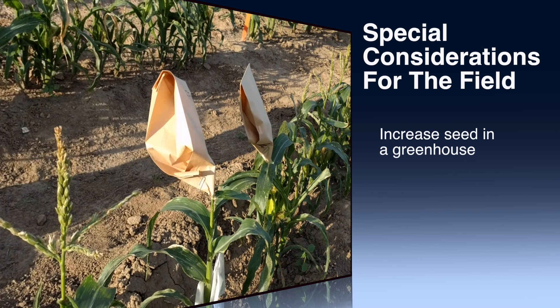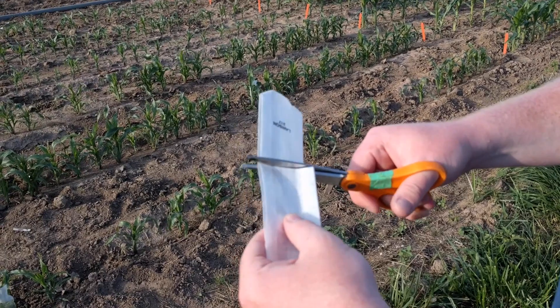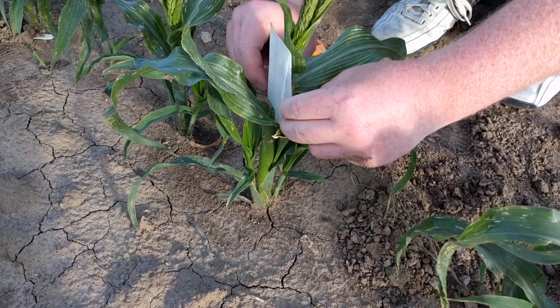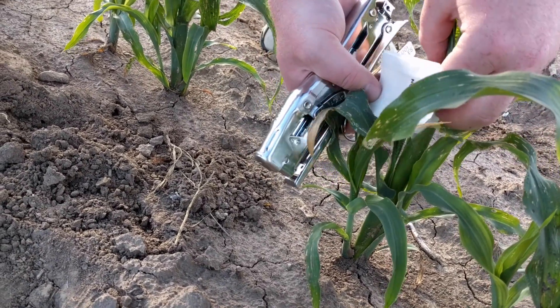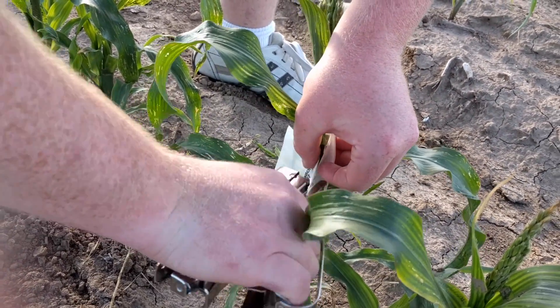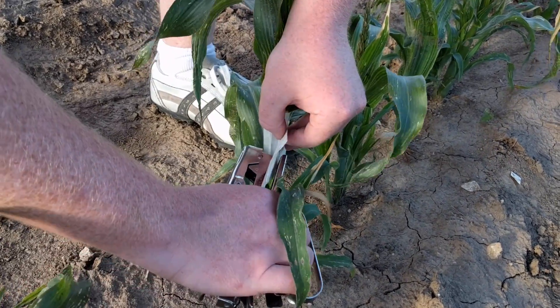It is highly recommended to increase seed in a greenhouse before attempting to grow mini maize in the field. In the field, wind can blow earshoot bags off of mini maize. The following protocol is recommended to secure the earshoot bags to the plant. When cutting the earshoot bag, save the bottom half that is normally discarded. Cover the ear as described earlier. After the earshoot bag is in place, staple the shoot bag's tab side accordion fold to the saved half as a backing. Repeat for the other side. This backing prevents wind from blowing off the earshoot bag.